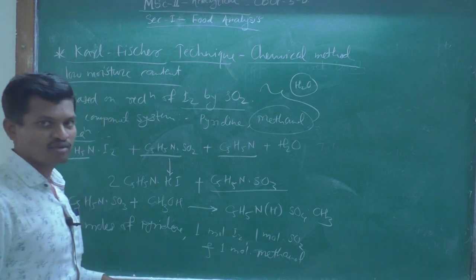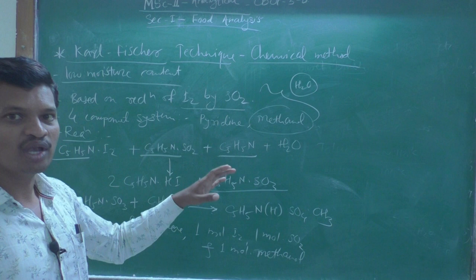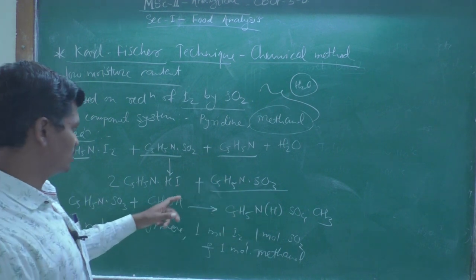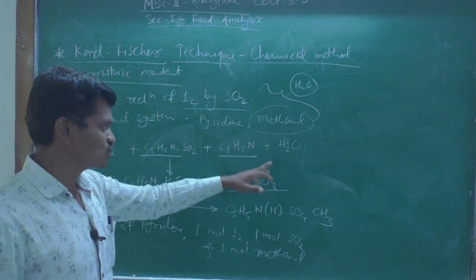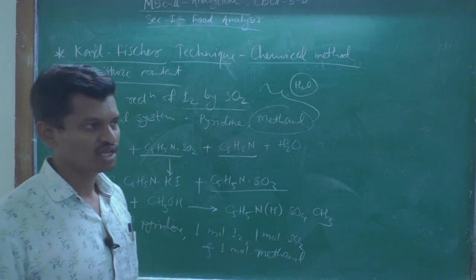are required for the reaction of 1 mole of water. So this water is only 1 mole, and for each mole of water, this mole ratio is required for the reaction.